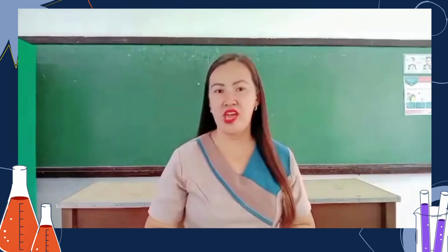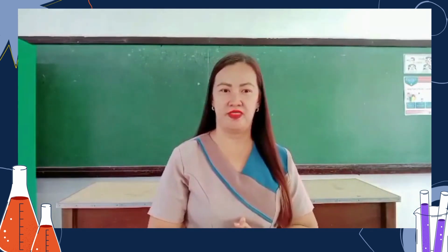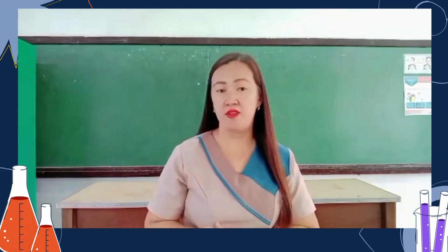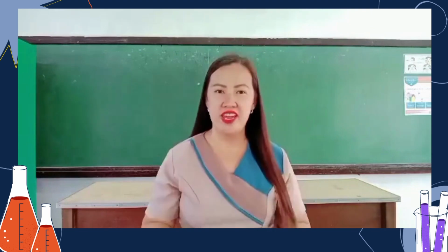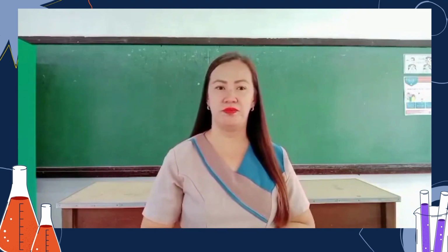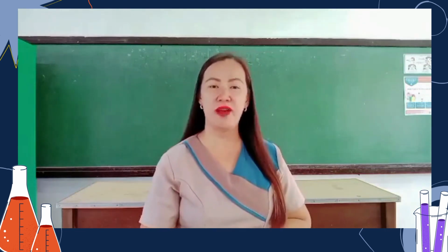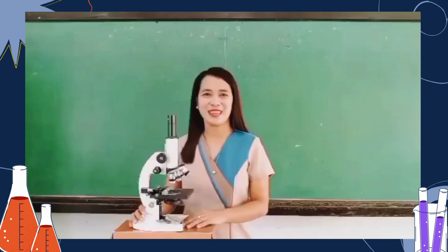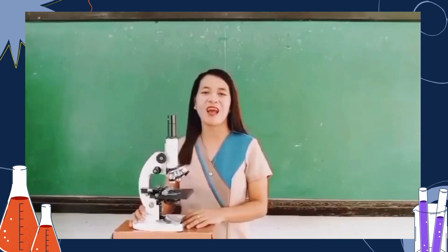Now, who among you here have already seen the microscope? Who among you here have already used the microscope? We are here to help you learn more about the microscope. Let us first identify the parts and functions of the microscope. And today we are going to discuss more about the microscopes.